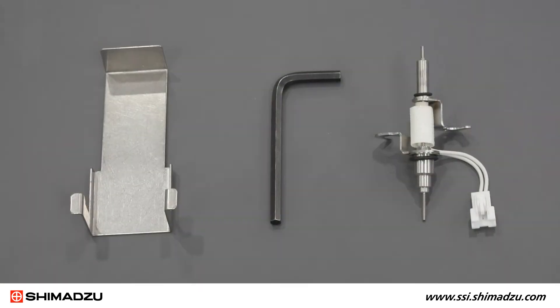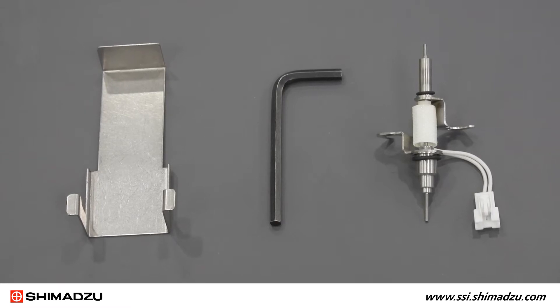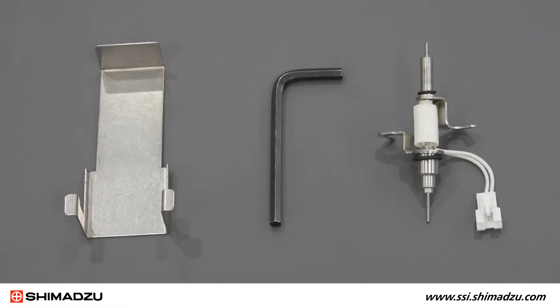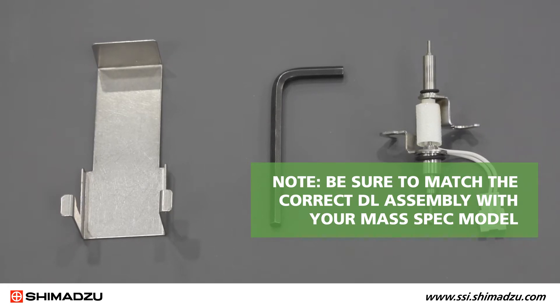You will need a 5 mm hex wrench, a drawing tool, and a replacement desolvation line DL assembly. Note: be sure to match the correct DL assembly with your mass spec model.